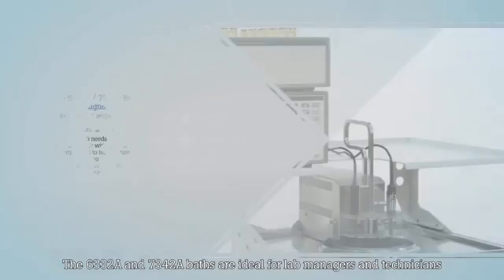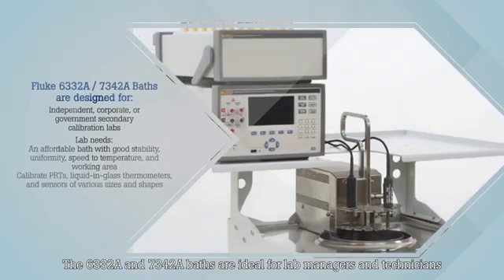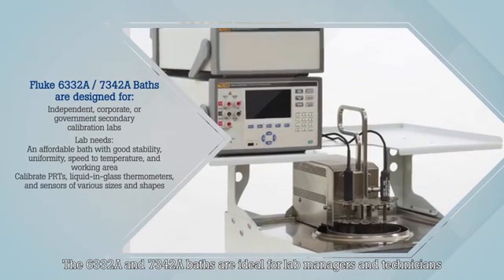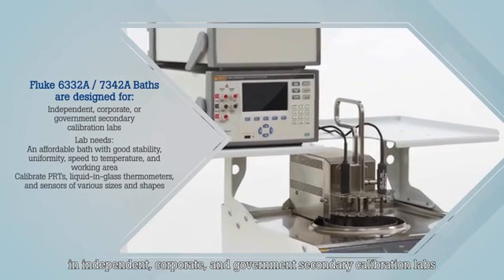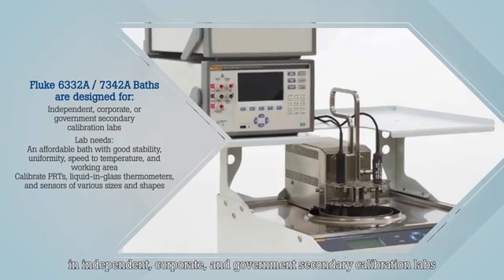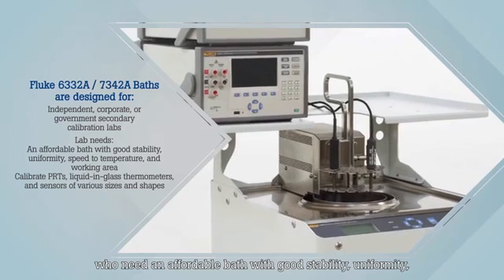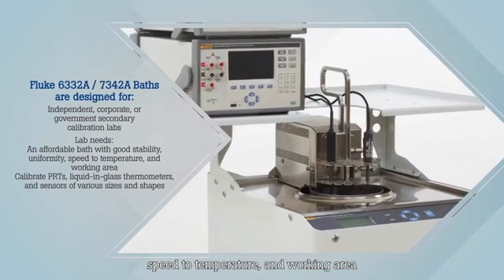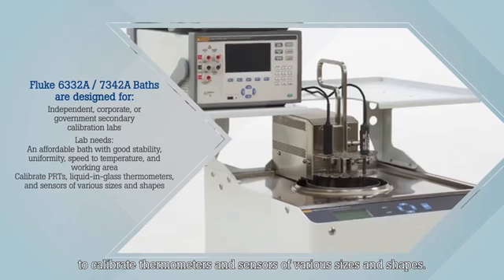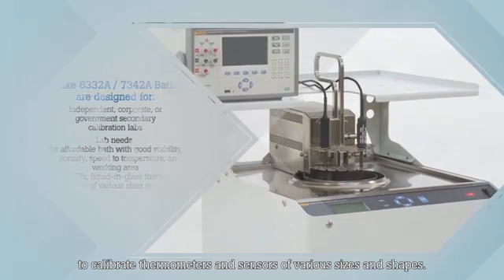The 6332 and 7342 baths are ideal for lab managers and technicians in independent, corporate, and government secondary calibration labs who need an affordable bath with good stability, uniformity, speed to temperature, and working area to calibrate thermometers and sensors of various sizes and shapes.